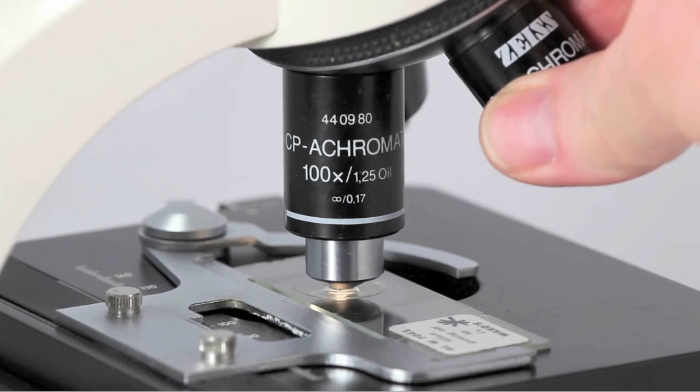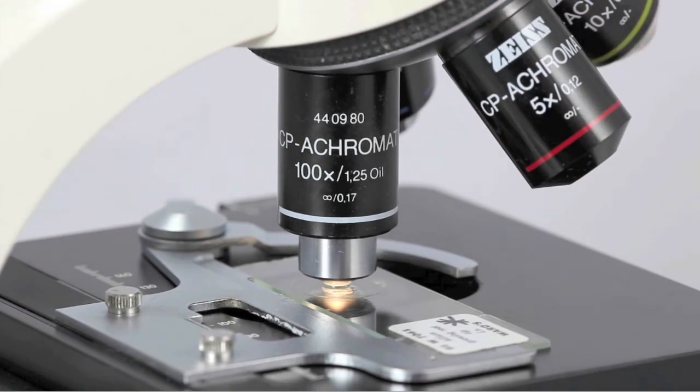Rotate the oil immersion lens into place. Now you're ready to observe very small objects, such as bacteria.